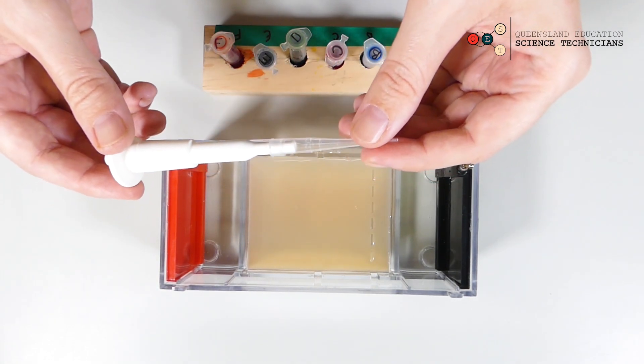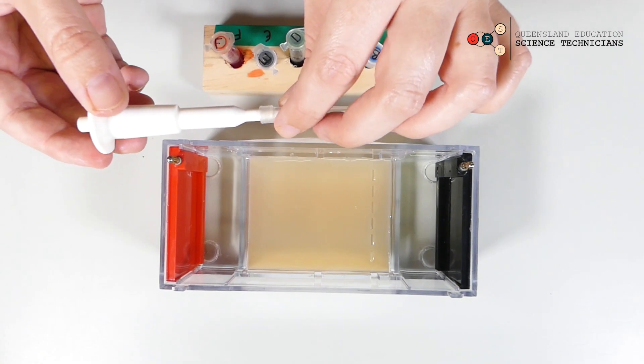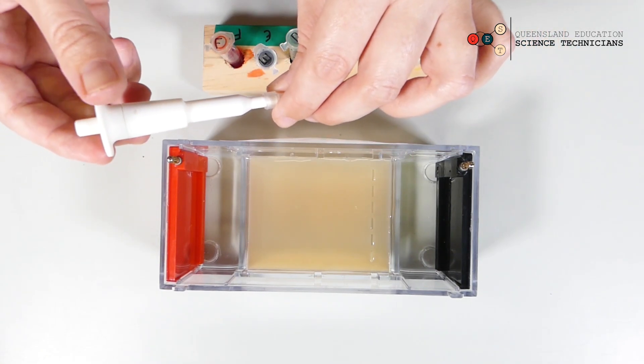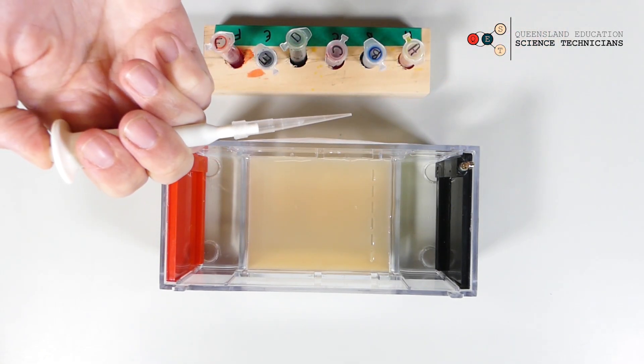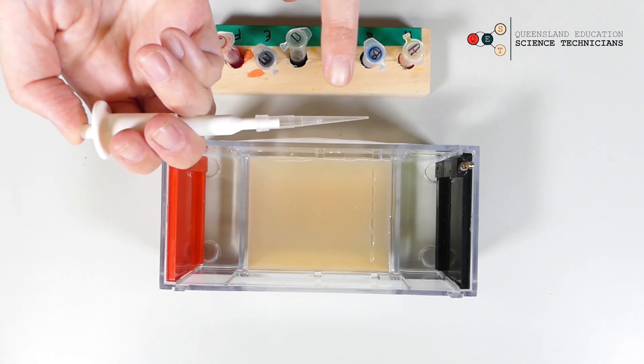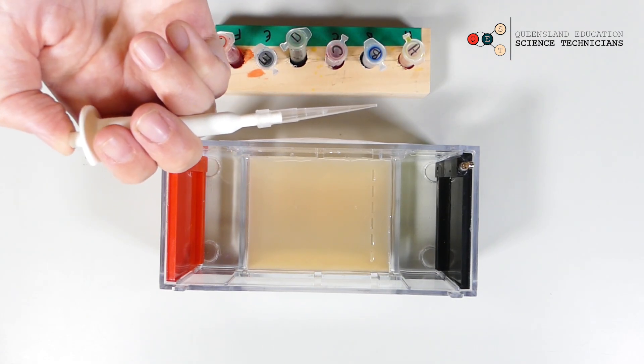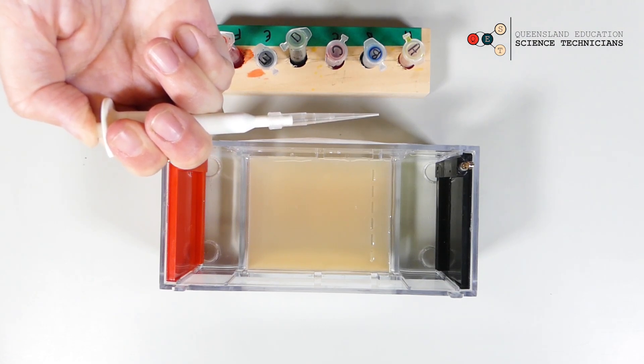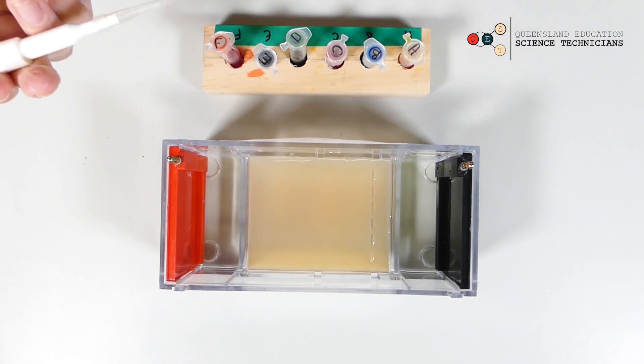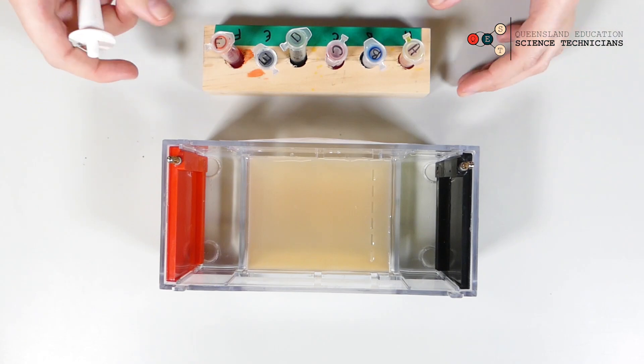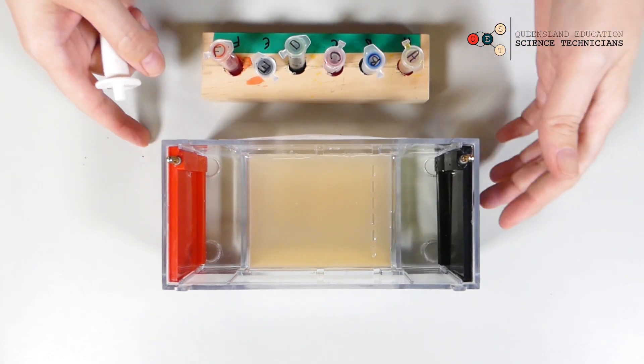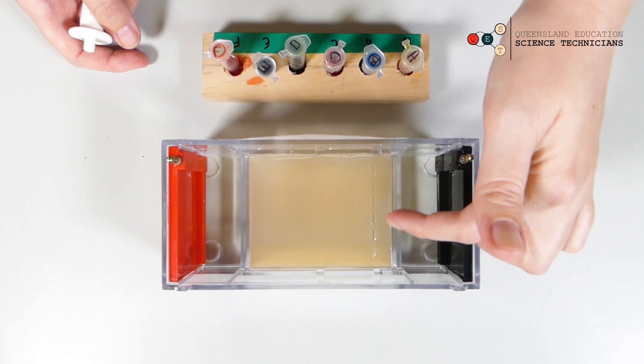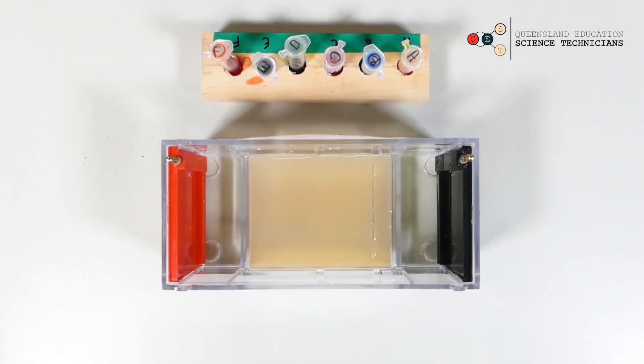We have these little micropipettes. They are pretty simple, they don't do anything fancy. Just click the button in and out to pull up your sample into the pipette tip, and then just push it out in once to push your sample out. So we're going to load up our food dye mixtures into the wells in our gel, and just keep a note of which dye you're putting into each well.